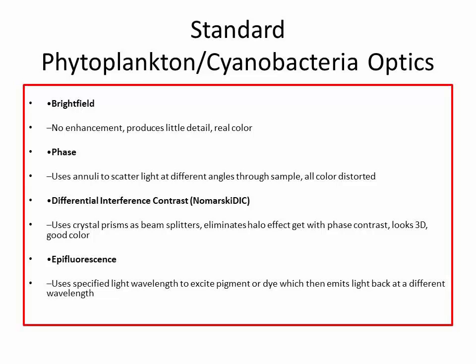Do you have a question? So could you get a UV flashlight? Oh, a dark light, black light or something, that would just shine on while you're watching? I don't think so, because you need to really get it underneath and coming up through. I'm not sure, I've never tried that. So, a $20 black light. The other thing about epifluorescence is you need certain wavelength filters, and they're not necessarily the black light filter. So no, you're probably going to have to go to that.